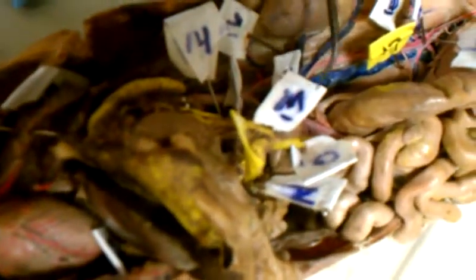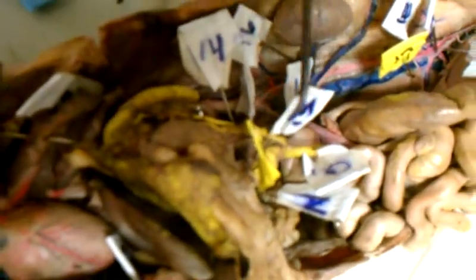Oh, so it's this one. No, that's the hepatic portal vein. This one. See that one right there? Yes, I got it now. So that's the gastrosplenic vein, hepatic portal vein. What's this one? Splenic artery? No, vein. Okay, that's the splenic vein. Yeah, I was right. That's the splenic vein right here.